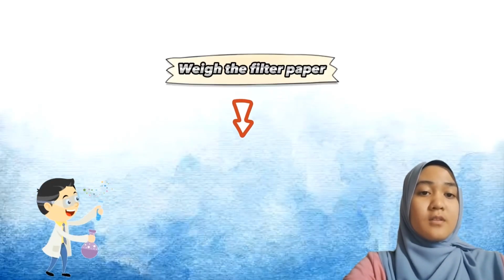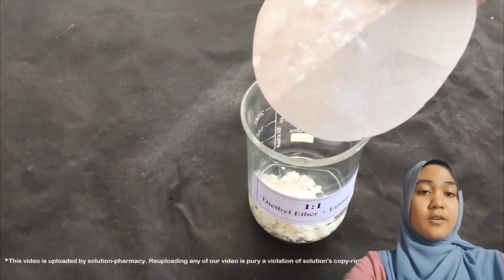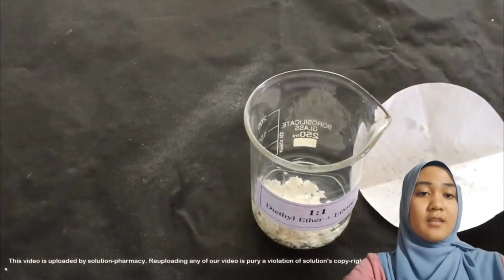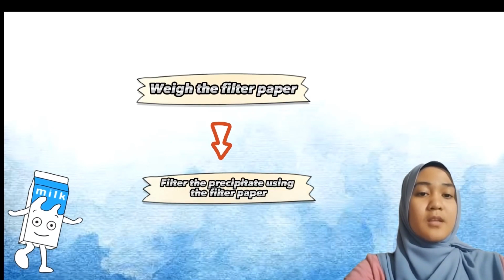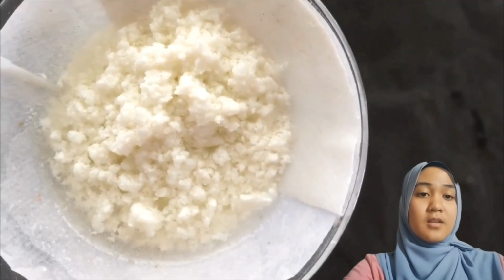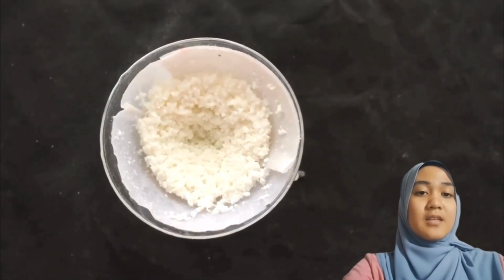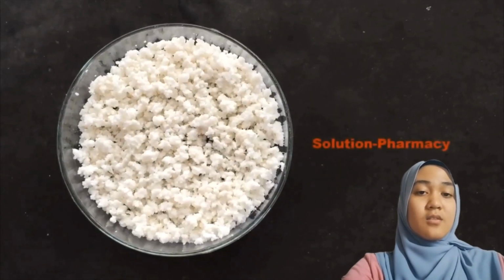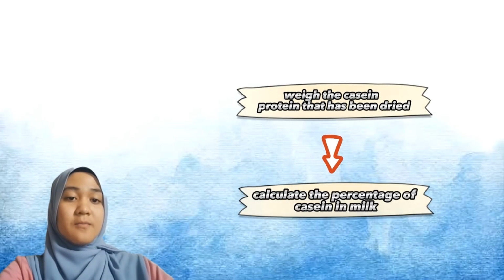Next, weigh the filter paper and filter the precipitate. Pour the precipitate into a 50 ml combination of diethyl ether and ethanol. Weigh the filter paper and filter the precipitate for a final time. Allow the solvent to be completely removed from the casein before weighing it. As for the result, place the casein protein in a petri dish and set it aside to dry. A few moments later, weigh the dried casein protein and calculate the percentage of casein in milk.